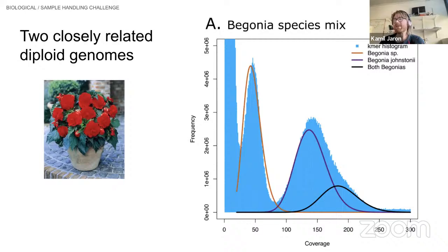But when they sequenced it, people really thought that this is the heterozygous peak and this is the homozygous peak, because they were not thinking about stoichiometry. Obviously, it can't be. How can it be a 1 and 2 peak and a 2 and 4 peak if they're not 1 to 2? They are not. It was actually Lucia who figured all that out. I actually think that's how we bonded, when we saw some weird data sets early on.